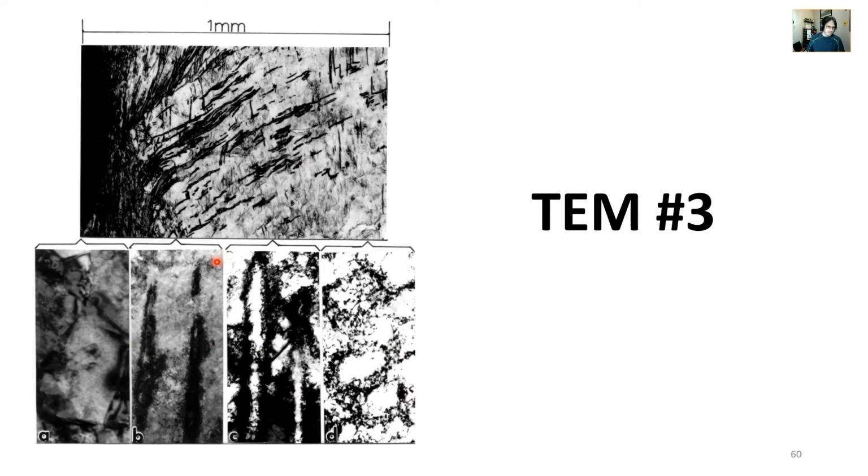And maybe it's not the best figure I've ever made, but it was showing schematically what kind of microstructures you get at different intervals away from the crater surface. So this is the edge of an impact crater surface. You see all these interesting microstructural features. Here you have heavily dynamically recrystallized grains. Here you see microbands, and here you again see microbands, but they have a slightly different morphology and they're somewhat bigger. And then further away from the crater surface, you get dislocation cells.